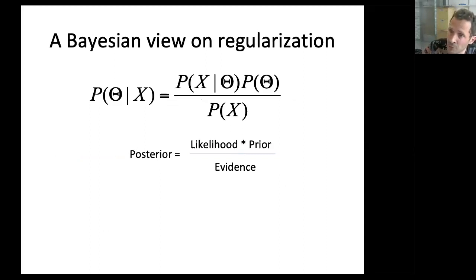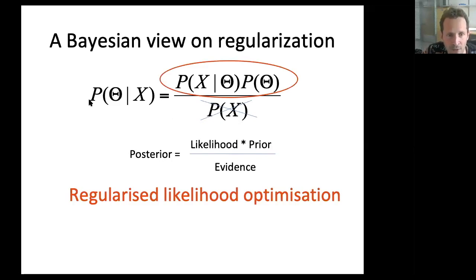So what I set out to do in Cambridge was to put that reconstruction problem inside a Bayesian framework. So Bayes' law says the posterior is the likelihood times the prior divided by the evidence. Now, the evidence, the probability of observing the data, perhaps depends on how much money you have nowadays, but once you have the data, it's irrelevant. So we can optimize the probability that a certain model that we have is the correct one given the data by optimizing a regularized likelihood function, the likelihood being the probability of observing the data given the model, and the prior being the probability of that given model that comes from sources that are not your data. So what do I know about cryo-EM reconstructions in the absence of data, or before I collect any data?